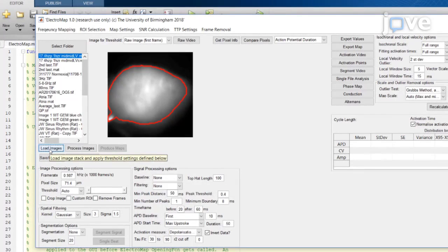Once loaded, the first frame will appear and the red outline will indicate automatic thresholding of the image. If desired, modify this to a threshold based on the signal time course amplitude by changing the option in the image threshold drop-down menu.